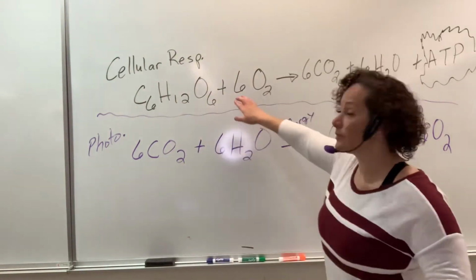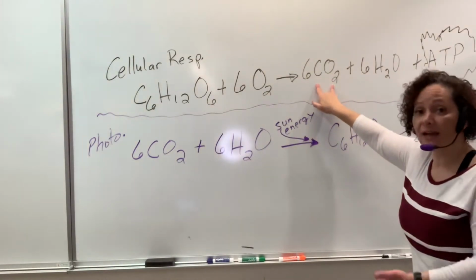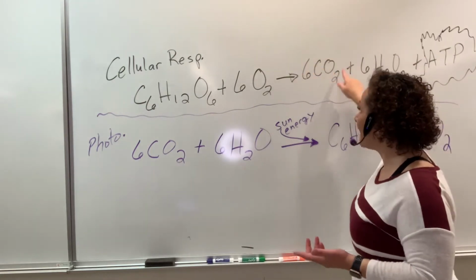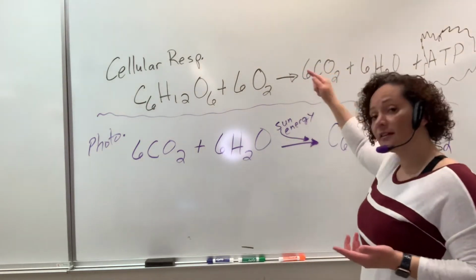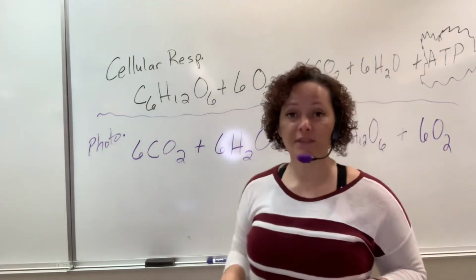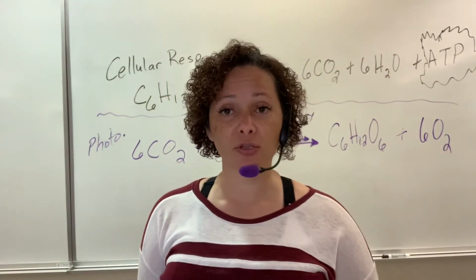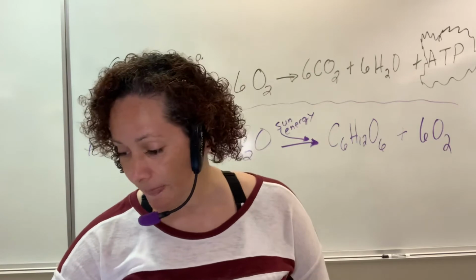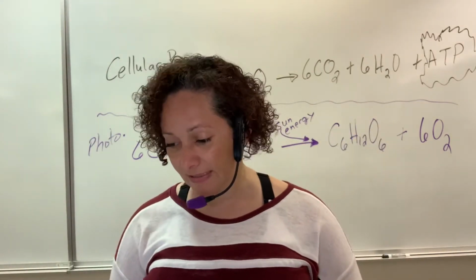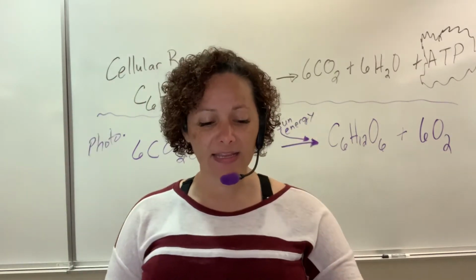If we're working cellular respiration and CO2 is coming out of the reaction of whatever organism we're testing, this is how we're going to be able to figure out the levels of cellular respiration of our organism, depending on the amount of the CO2 in that, and it's calculated into a respiration rate, which was on the previous page. So follow the instructions, plug it in. Mine has actually been plugged in for 90 seconds already. Use your pointer, okay? You want to get this set up.